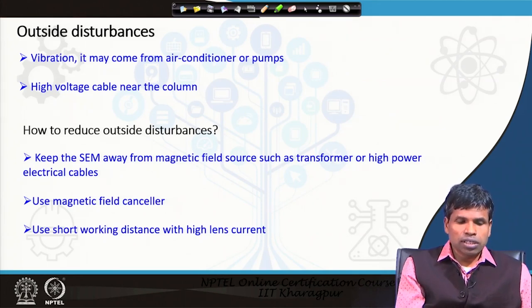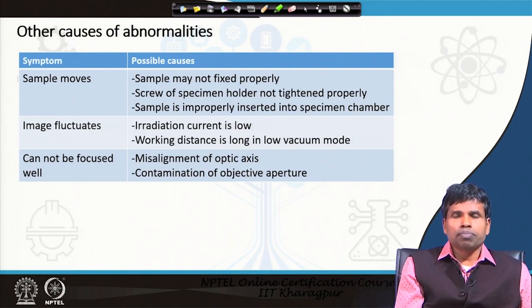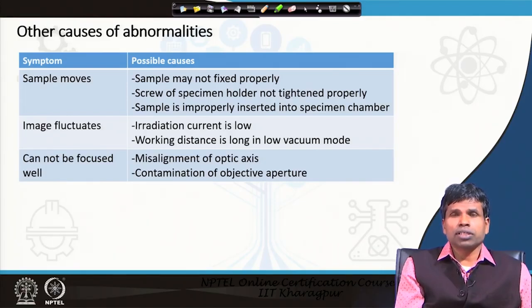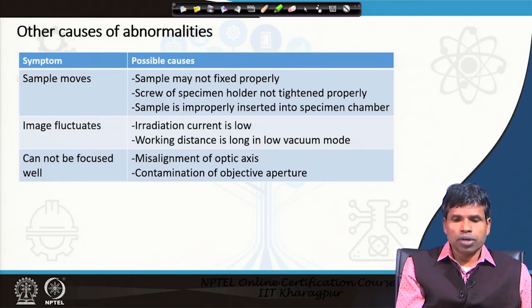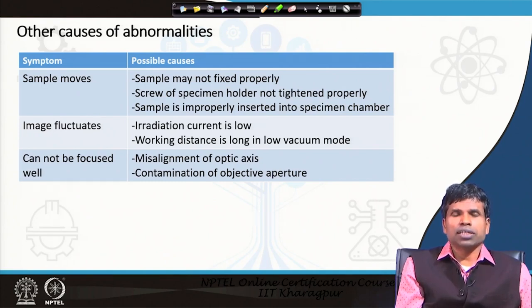Short working distance means the sample is placed very close to the objective lens; when high lens current is applied, outside effects will not strongly affect signal collection. Other causes of abnormalities include the sample moving if not fixed properly, the screw of the specimen holder not tightened properly causing poor grounding, or the sample being improperly inserted into the specimen chamber. Other reasons include low irradiation current, long working distance, misalignment of the optic axis, and contamination of the objective aperture — all of which cause abnormalities in the SEM image.